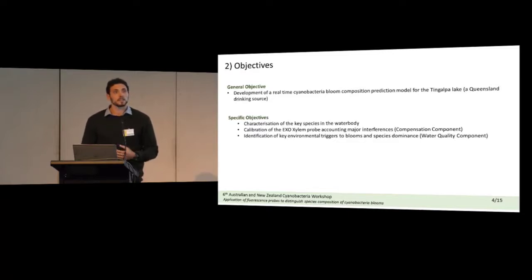This research already has as an industry partner SEQ Water, and altogether we have defined the Tingalpa Lake, which is a Queensland drinking source reservoir, as the location where the study will be conducted. In order to achieve the main goal, we have ranked some specific objectives, such as the characterization of the key species in the water body, the calibration of the fluorescence probe, which in this case is the EXO probe, and the identification of key environmental triggers to blooms and species dominance for the site of Tingalpa Lake.